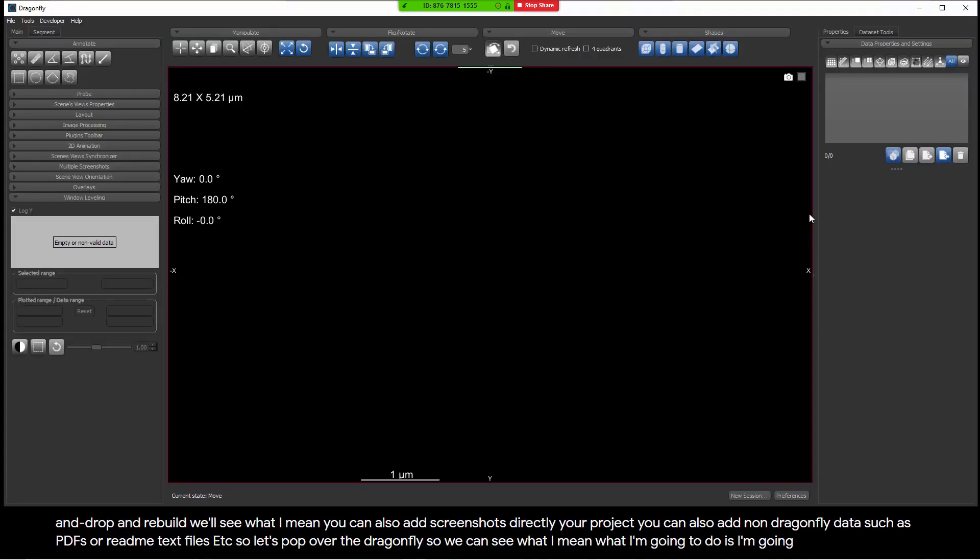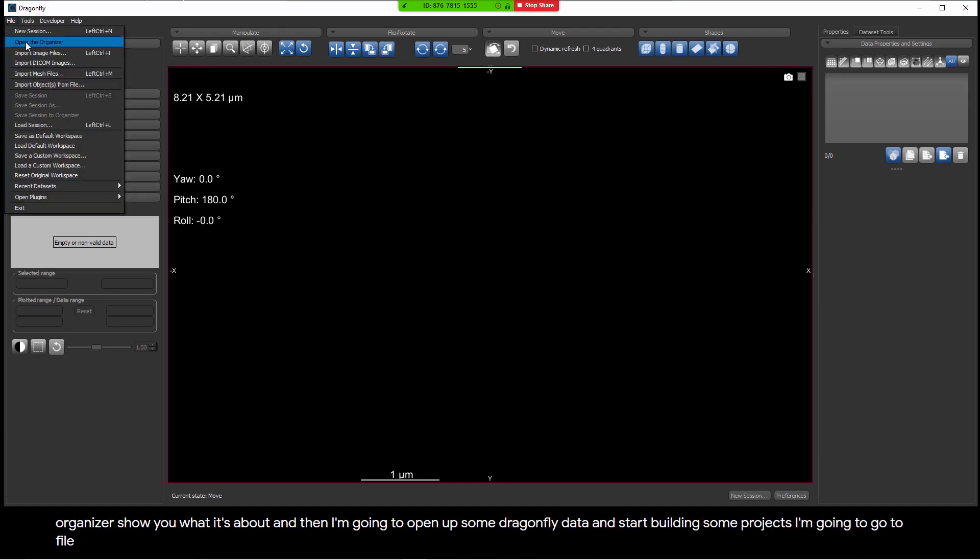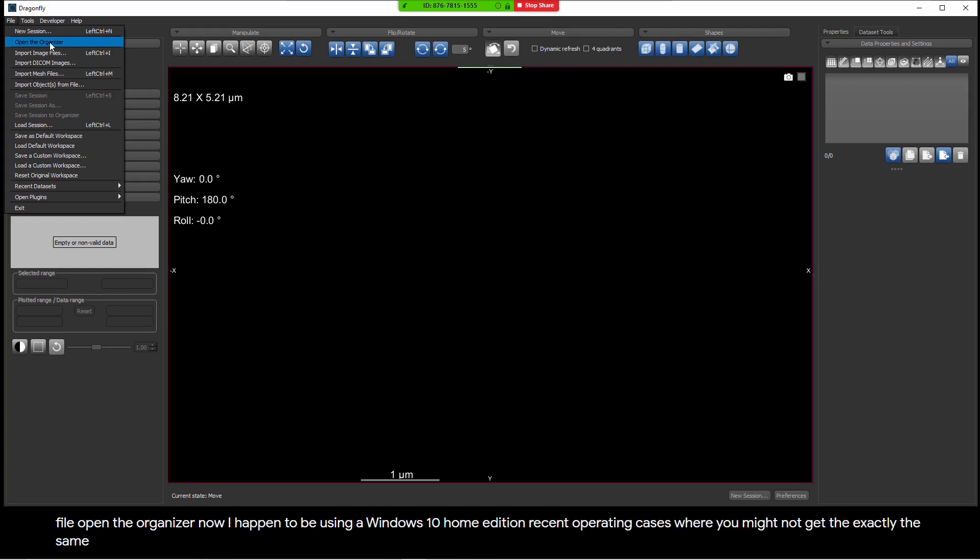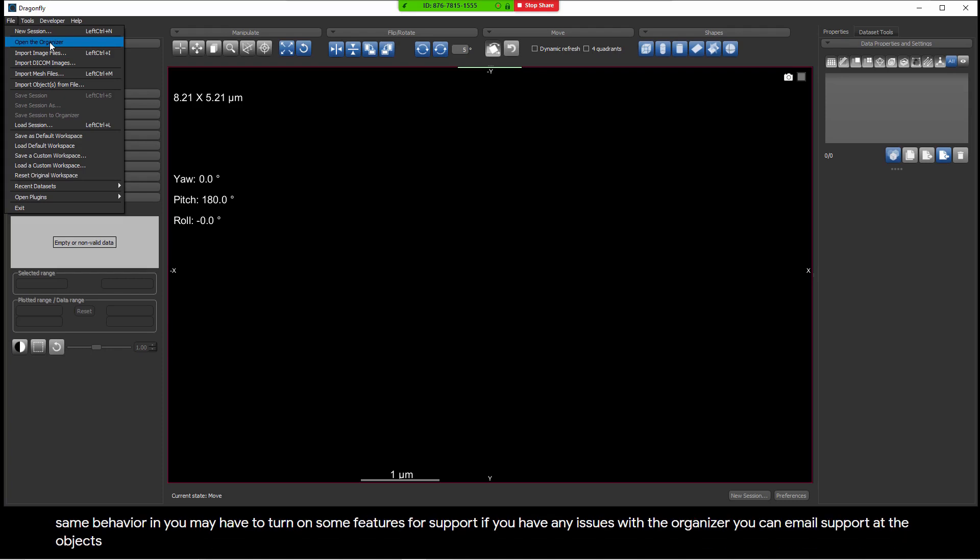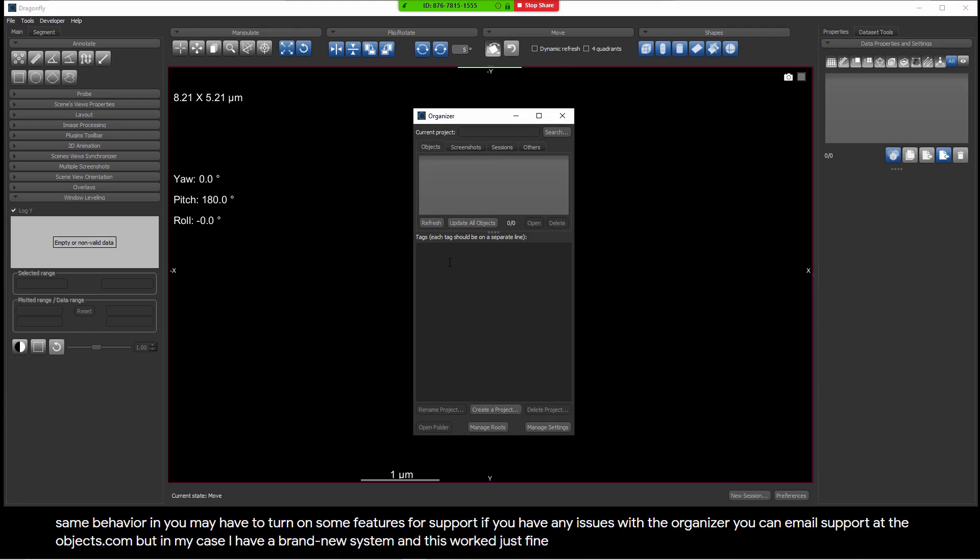Let's pop over to Dragonfly so we can see what I mean. I'm going to open the organizer, show you what it's about, and then I'm going to open up some Dragonfly data and start building some projects. I'm going to go to File, Open the Organizer. Now, I happen to be using a Windows 10 Home Edition recent operating system installation. There are some cases where you might not get exactly the same behavior, and you may have to turn on some features for support. If you have any issues with the organizer, you can email support at theobjects.com. But in my case, I have a brand new system, and this worked just fine just opening the organizer.